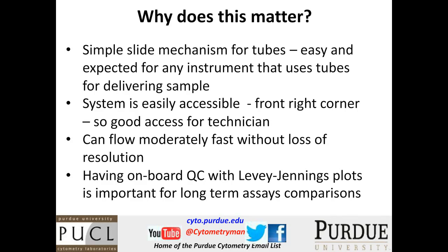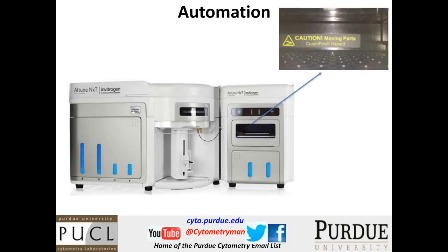So there are a couple more features that I'll mention in the last few minutes of my presentation. And one of these is automation. I've already shown the fact that you can put microtiter plates in here and run your microtiter plates directly into the system. It can be permanently hooked up, and in my lab it is permanently hooked up, and we switch frequently from running tubes in here to running plates in here.